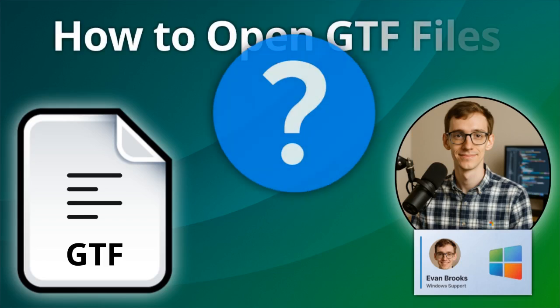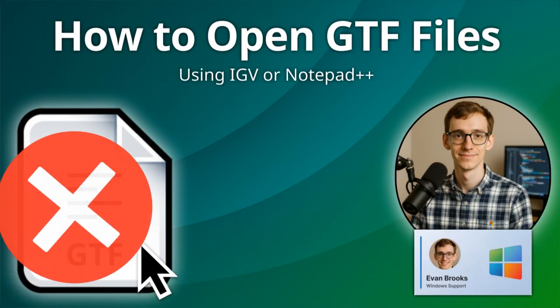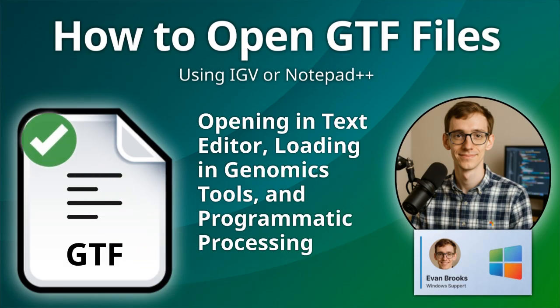Working in bioinformatics and dealing with a GTF file containing genomic annotations, these describe gene structures essential for genetic research worldwide. I'm Evan Brooks, Certified Support Engineer, and I'll explain how to work with these gene transfer format files.